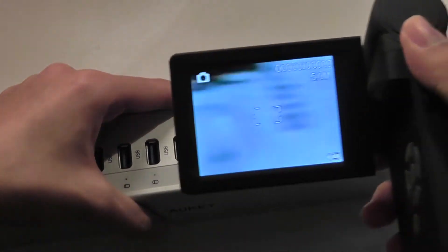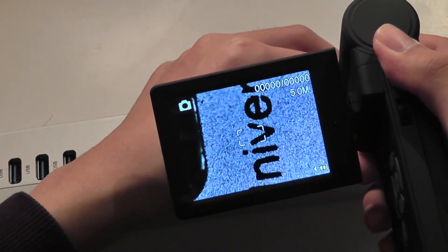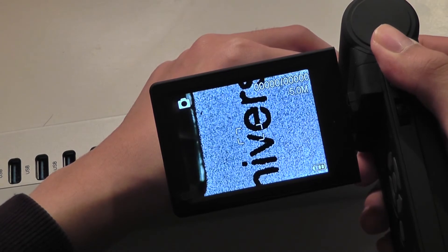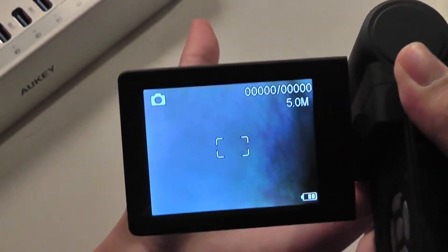If we try something like this, you can see the lighter surfaces are a bit easier to see. I can zoom in and get a bit clearer. I can zoom into the aluminum and see how that works. I can try my hand. That's going to work pretty well.